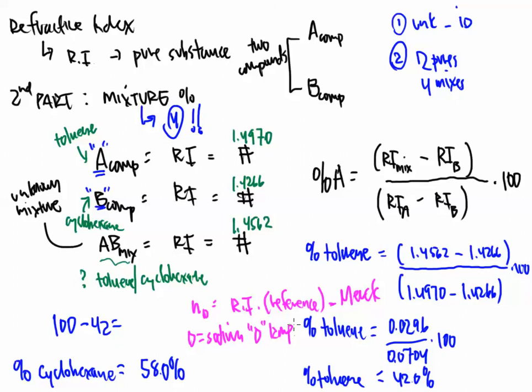Well, we don't want any of that to happen. We don't want this mixture of all of these different wavelengths to be shining into the sample. So we only use a light source that's providing 1 specific nanometer or wavelength of light. And that's the sodium D lamp, and that's why the D is down below.